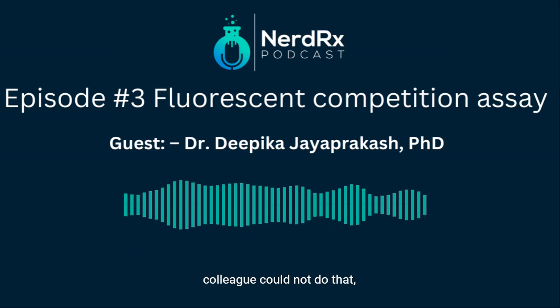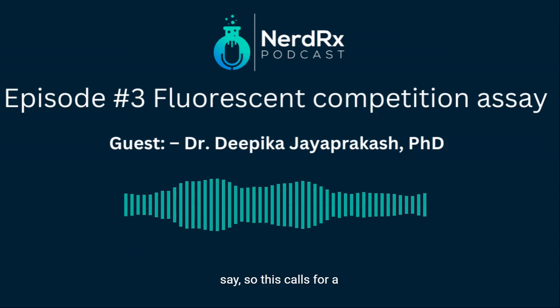But my colleague could not do that because the intensity of fluorescence was different. Each cell was giving a different fluorescent signal, which is why she ended up isolating a single clone, and from that she did the fluorescent competition assay. So this calls for a little experience, which can be easily gained.